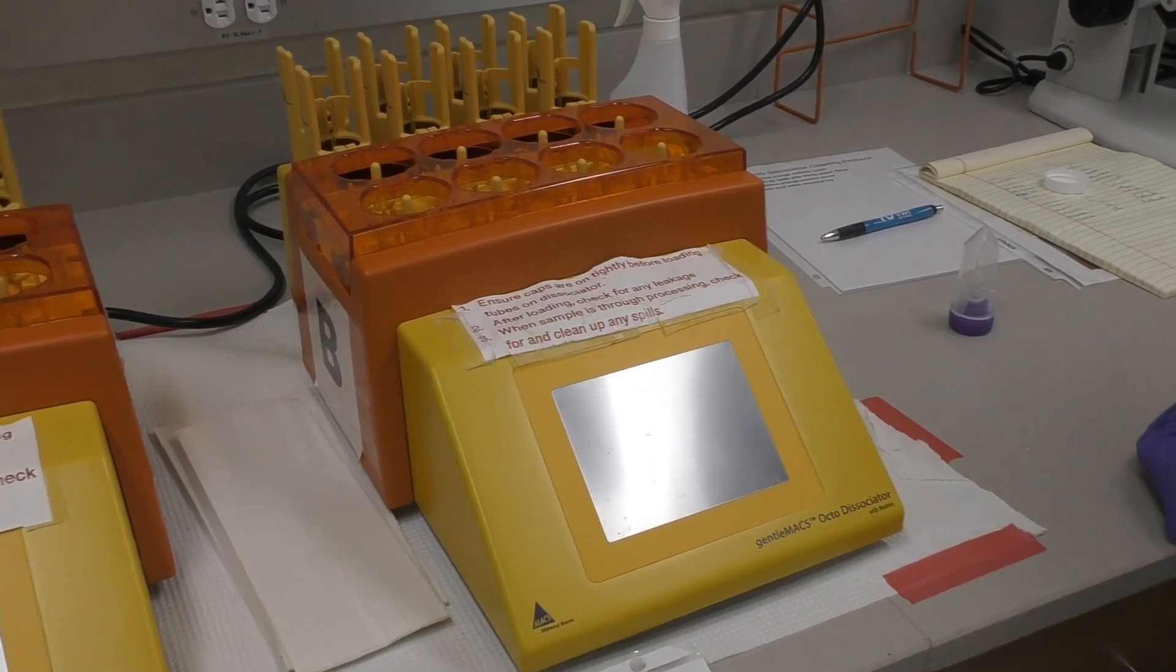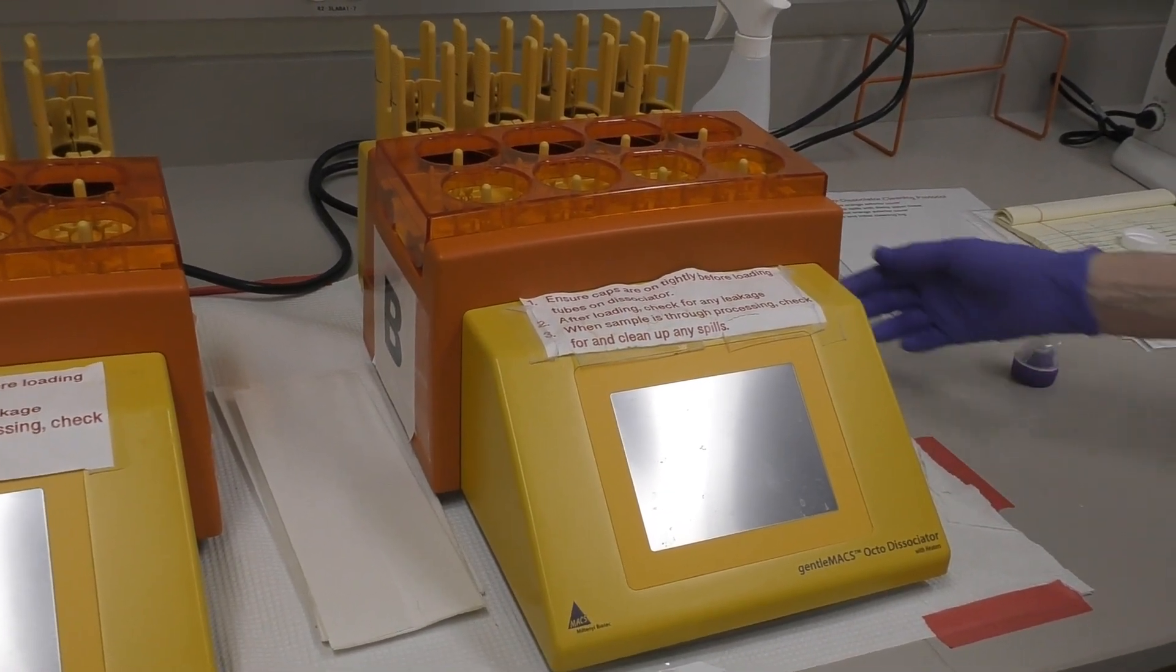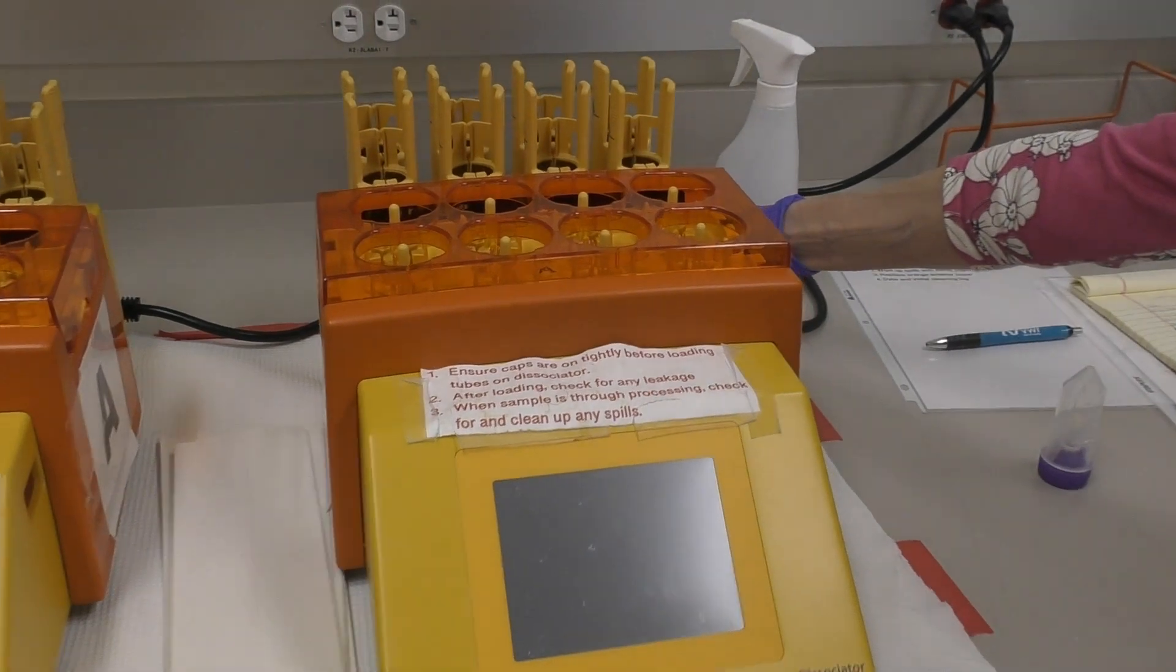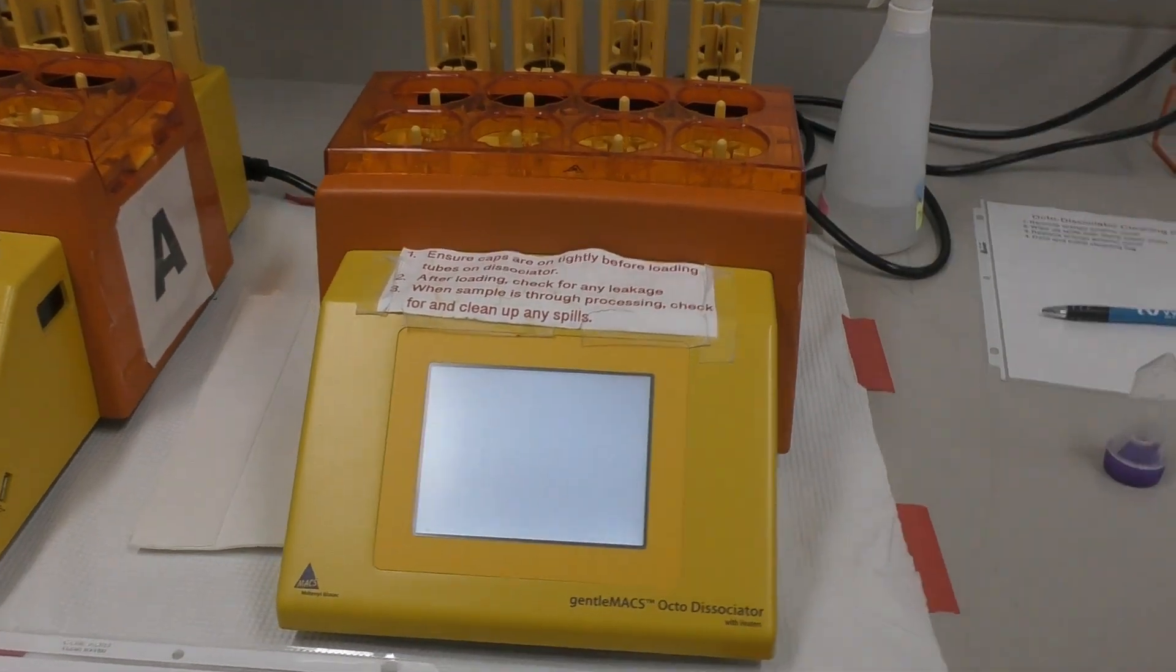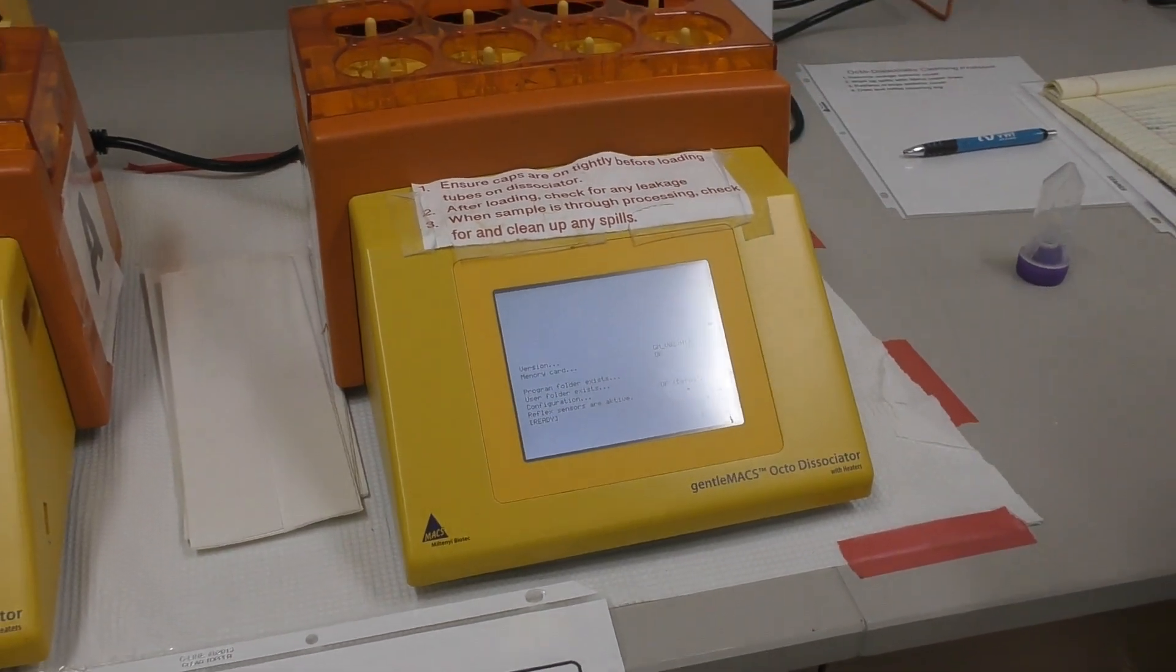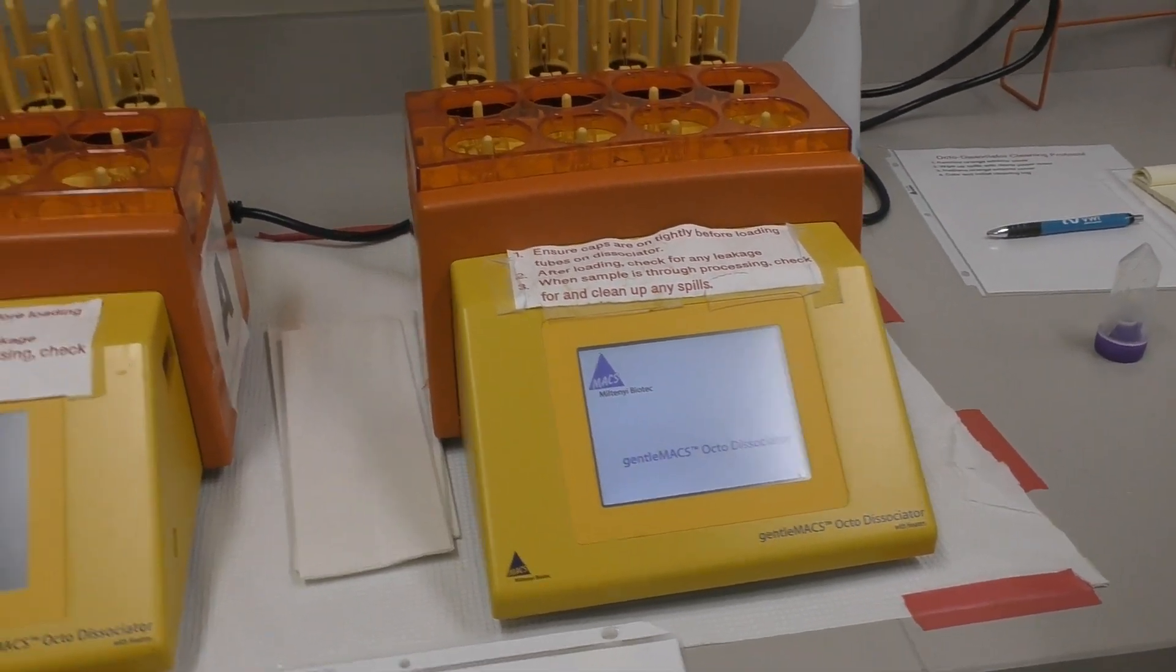This is the operation of the Gentlemax Octo Dissociator. First, turn the instrument on with the switch at the back. The screen will come up and display the menu.